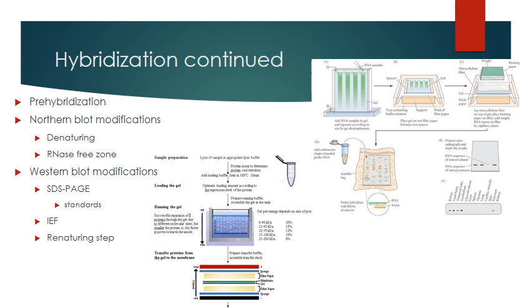In western blot, there are also some modifications that exist. Western blot is a very common technique in virology and immunology labs, and that's because we use it for analyzing protein. The sample we frequently get in western blot is serum. That's where all our blood proteins are anyway. So if you get serum, you don't have to really worry about cells. You can destroy any cells that are there. We're not worried about them. So you get rid of the cells and you extract in the serum.